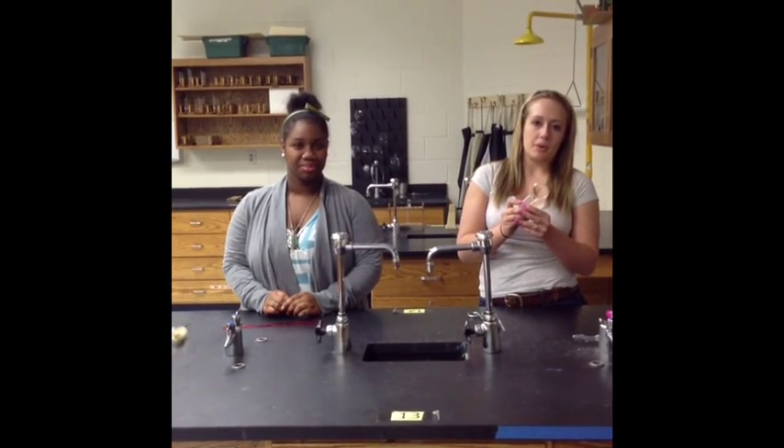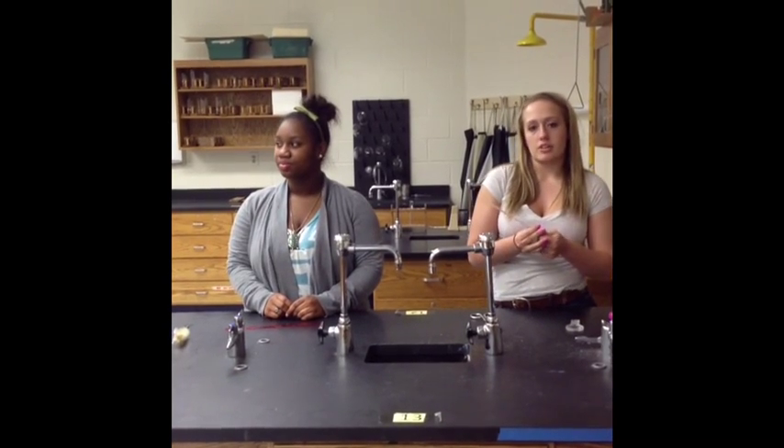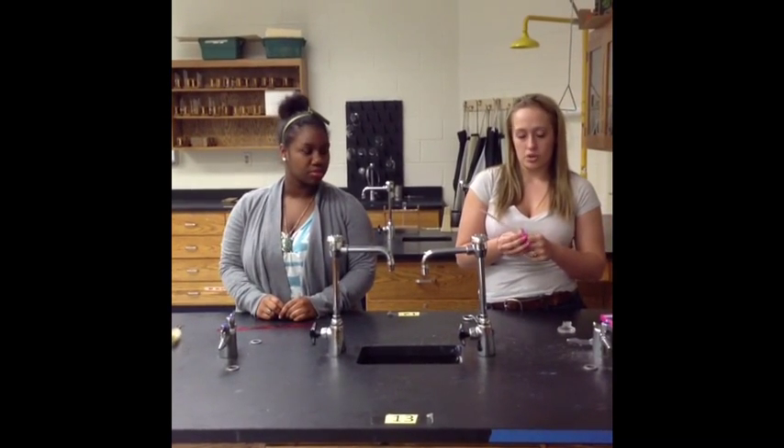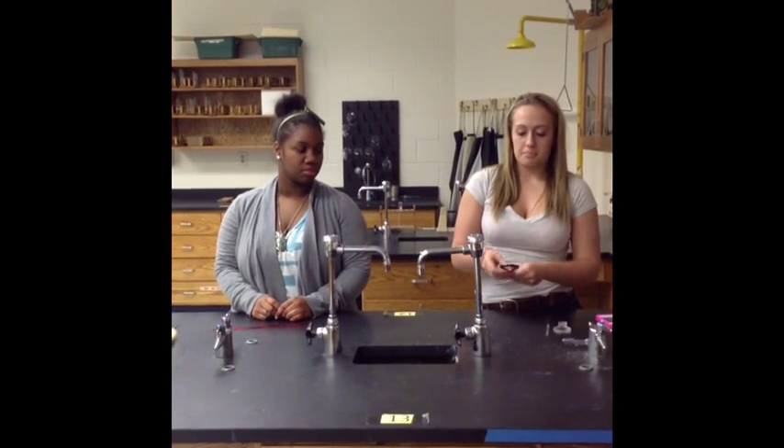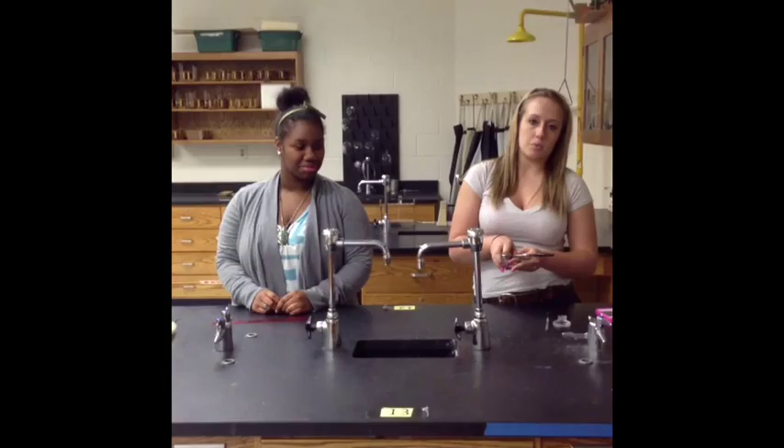This is a magnifying glass. You can use it to get a better view on things you're examining. This is a stirring rod — you use it to stir solutions that you have in a beaker or a flask. And this is a beaker tong, and you use it to move beakers, especially when they're hot.